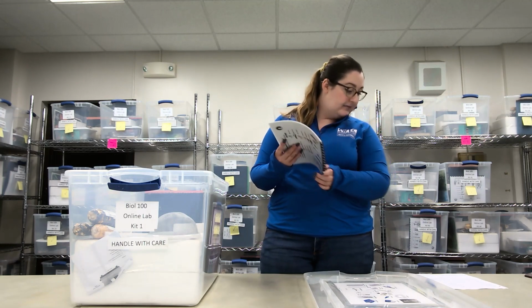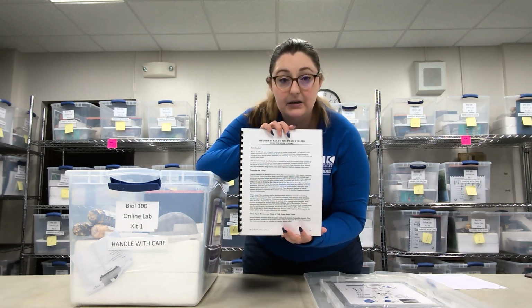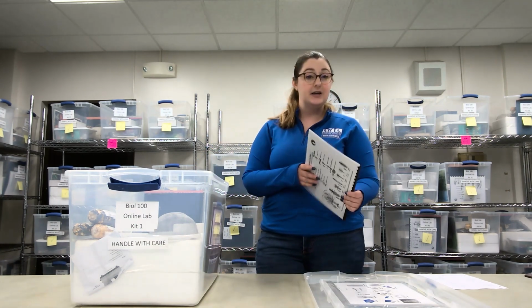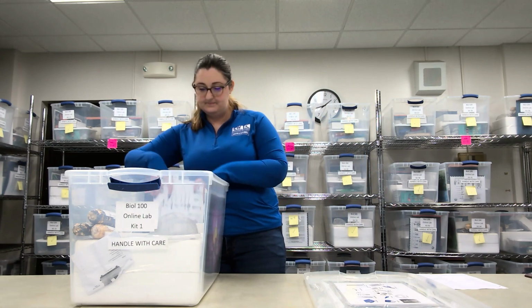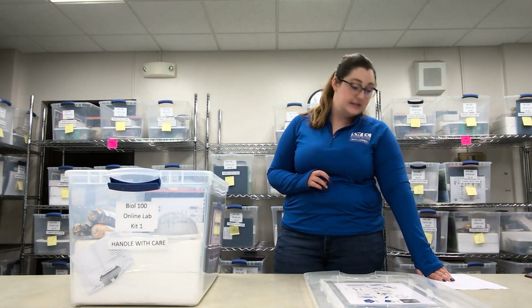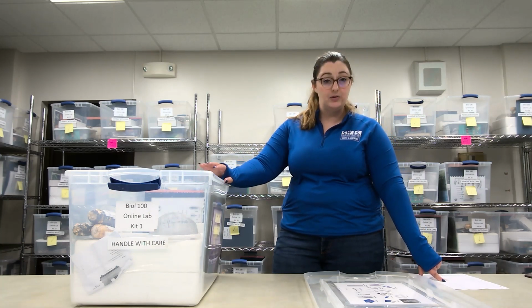From there, we have the laminated river watch key. That is this item here. Make sure that it is present in your kit. Slide it on in. Make sure you check off everything that was in the blue folder, the laminated river watch key, and we already went over the microscope.